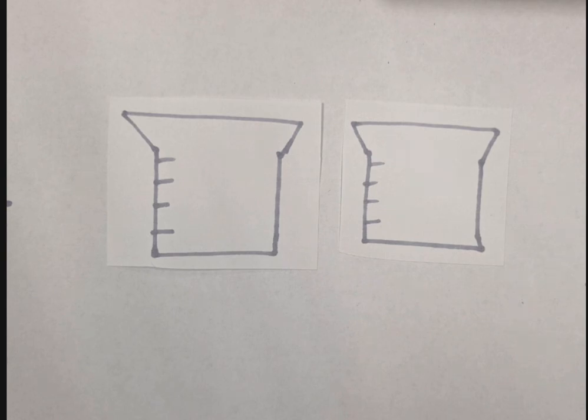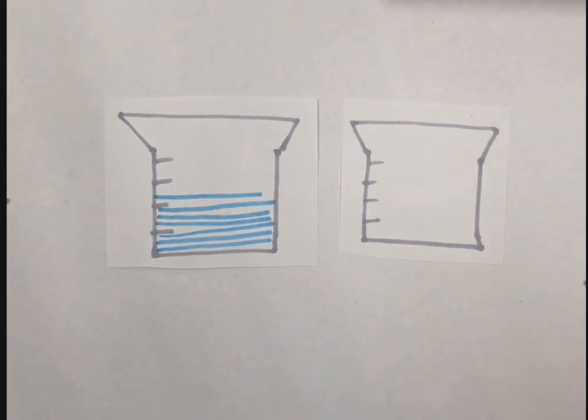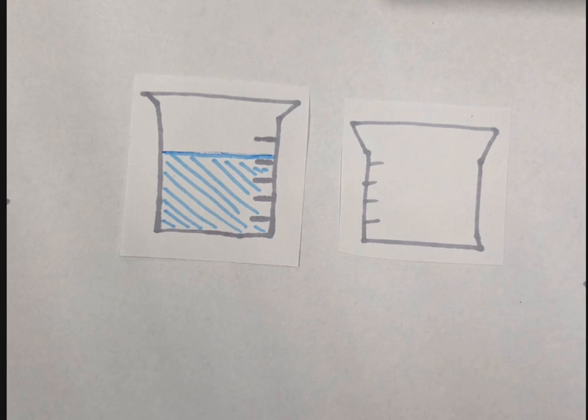Today, we will be performing and explaining a salt bridge and galvanic cell lab. Ready? Let's start filling our solutions. On the left, we'll have copper 2 sulfate, or CuSO4. For our second solution, we're going to have zinc sulfate, or ZnSO4.